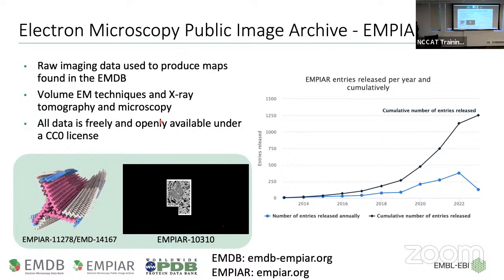So the idea being, if you've got some nice tomograms you're showing in your publication, probably put those in the EMDB. And if you have a full data set of 100 to 200 tomograms or something like this, then those can all go to EMPIAR, and it's far easier to deposit those sort of large data sets to EMPIAR in one go. It uses Globus and Aspera and things that can deal with you losing connection, which OneDep isn't quite so resilient on.